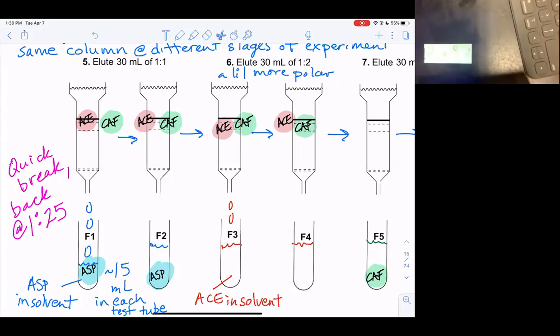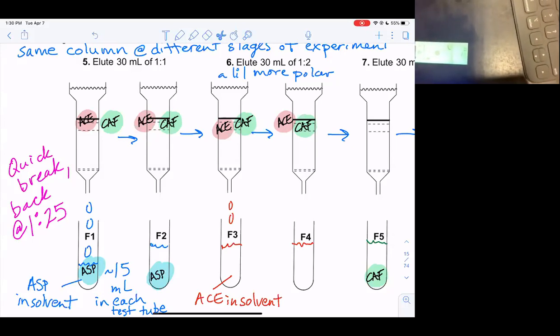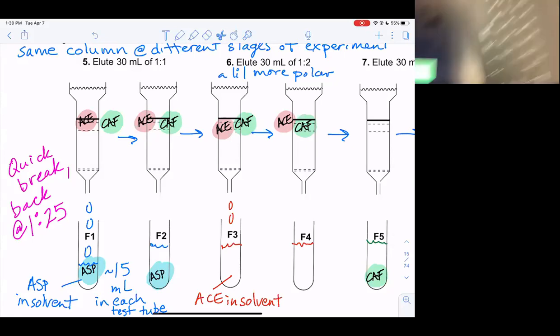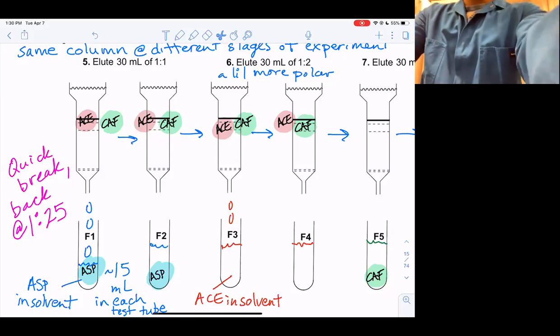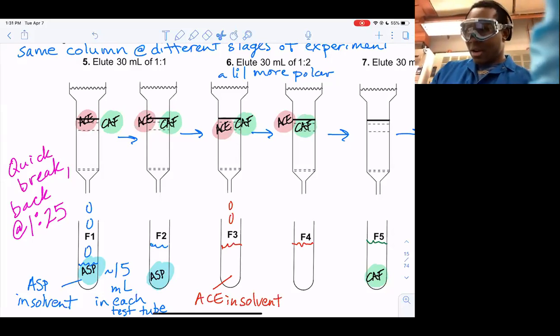Yeah, so this is what it looks like under the UV lamp. As you can see, the caffeine's on the far right, the middle is the acetaminophen, and the left is aspirin. At the top, we have the aspirin, in the middle at medium polarity is the acetaminophen, and the most polar thing is the caffeine at the very bottom there. That makes sense. So with that, we know what to look for whenever we spot each of the fractions that Avery is going to give us soon. And that's kind of our baseline.